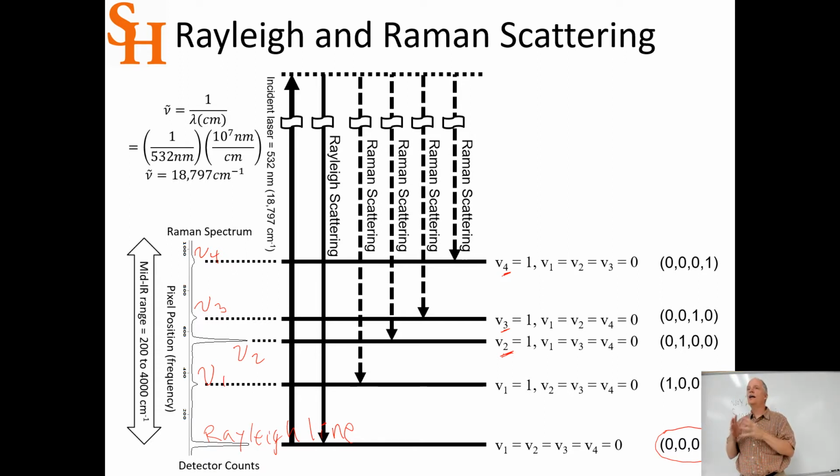For the Raman, it's the size of the electron cloud. So we're talking about the polarizability of the electron cloud around the molecule, and if something can make that cloud bigger and smaller, that's a huge change in polarizability. The cloud's getting more diffuse and flexible, or tighter and smaller and harder. And so it's changing that electron cloud size.